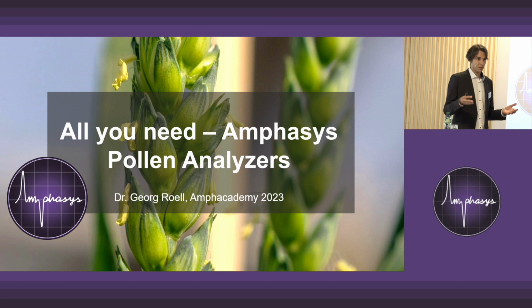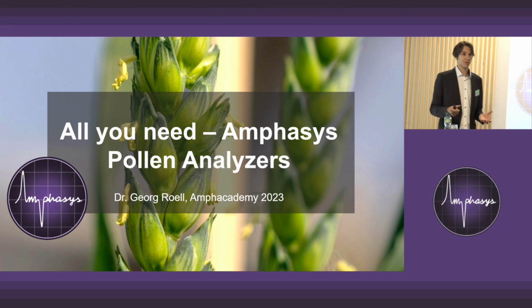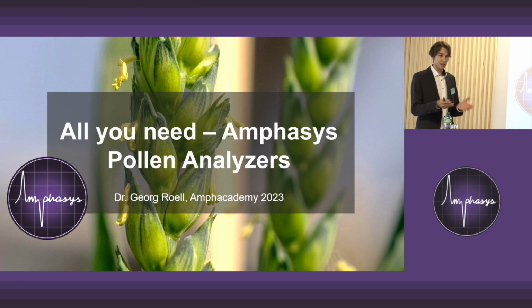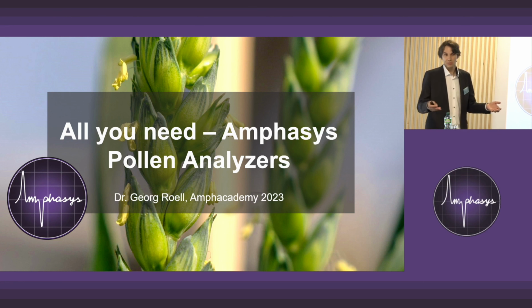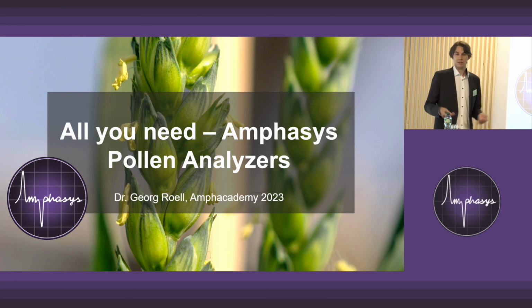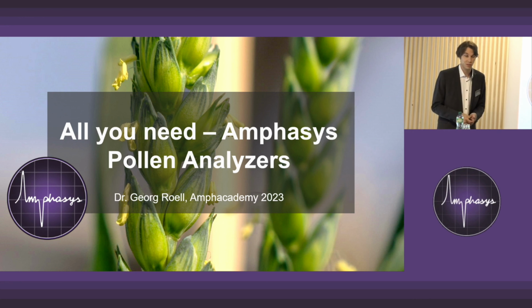One example could be, you're looking under the microscope at a certain specific area, maybe looking at 100 pollen grains, and nothing is germinating. Maybe if the pollen viability is pretty low, then at a different spot there is something germinating. Another thing can be that the buffer, the conditions, are not right. Maybe you should have waited longer, as germination takes up to 2, 3, 4 hours even.